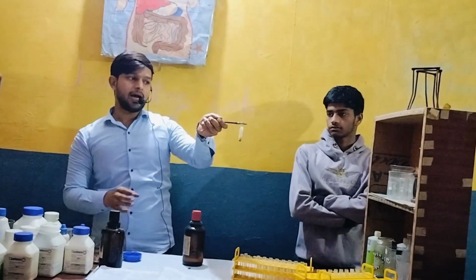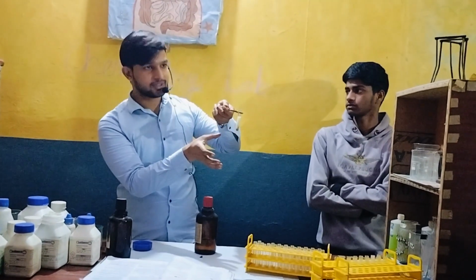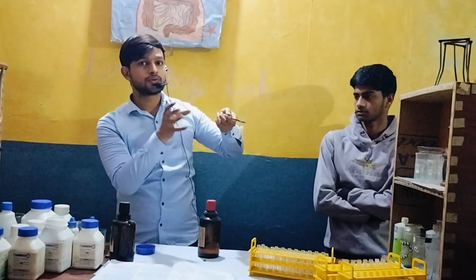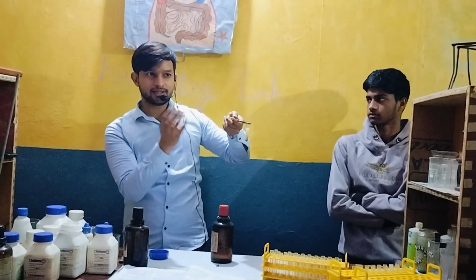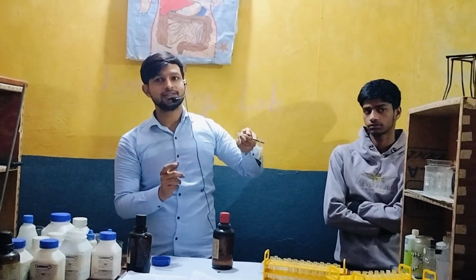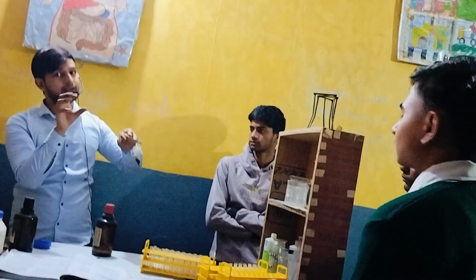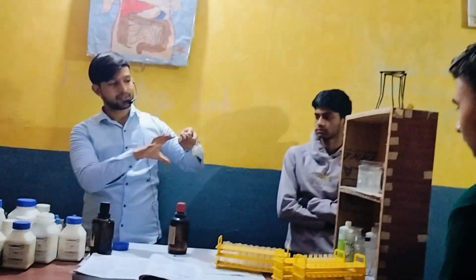Also, if you touch this test tube, it will become hot. So can you name the reaction in which the test tube becomes hot? Right, it is an exothermic reaction, the reaction in which heat comes out from the test tube.